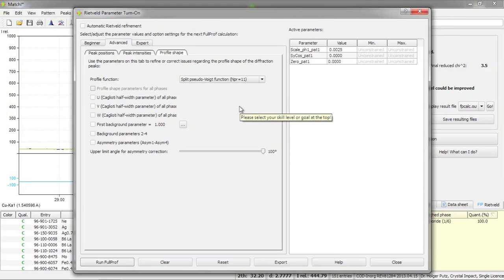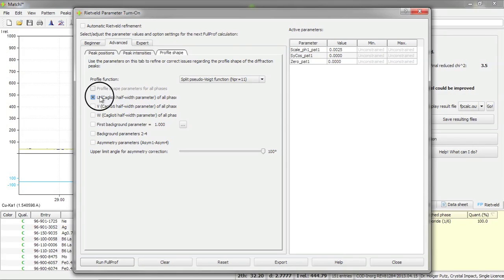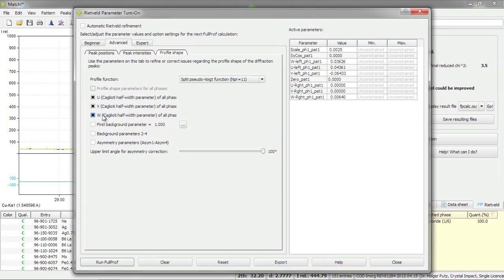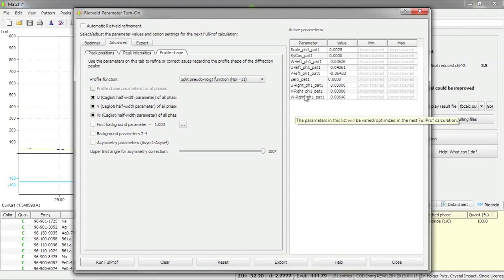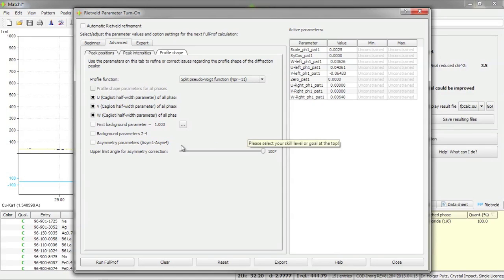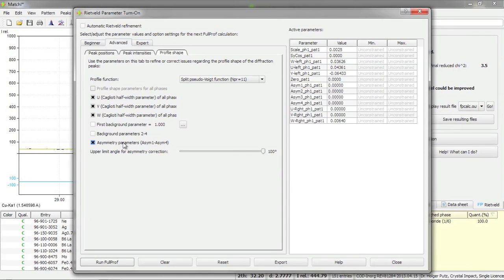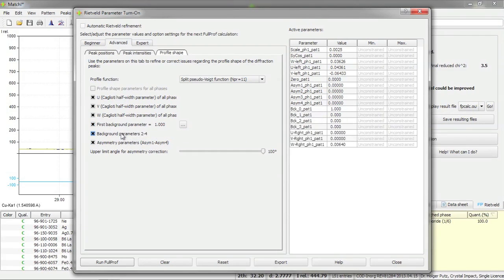So this function now has separate parameters for the left and the right part of the diffraction peak, so these can be refined separately. I will now add parameters for the profile function. As you can see we have left parameters and right parameters. I would like to add the asymmetry parameters. And finally I would also like to refine the background.